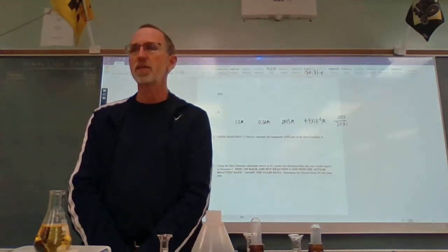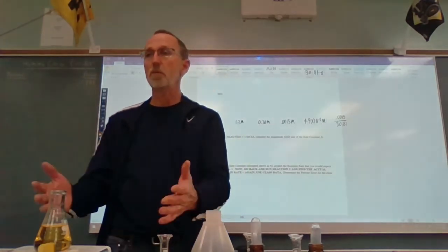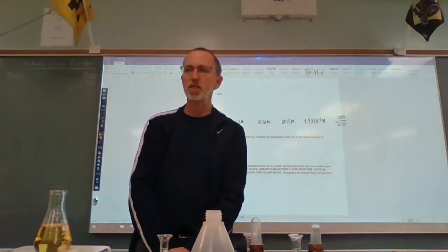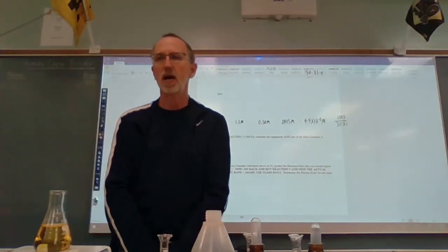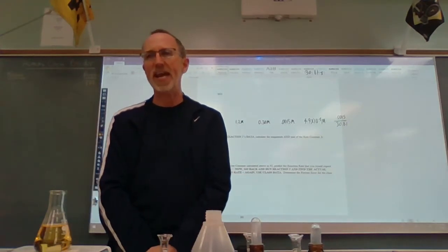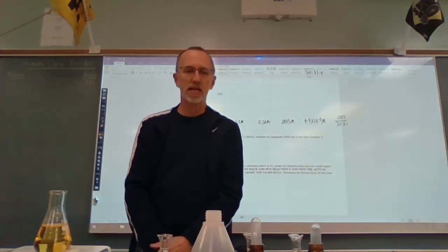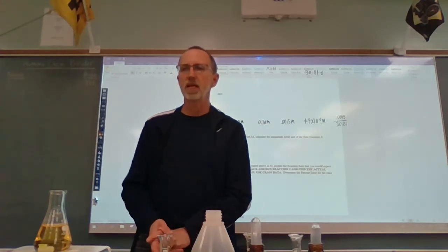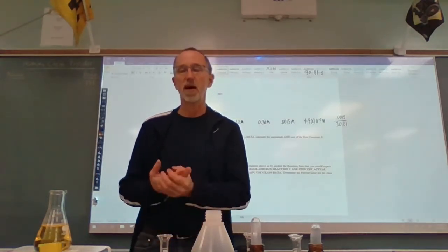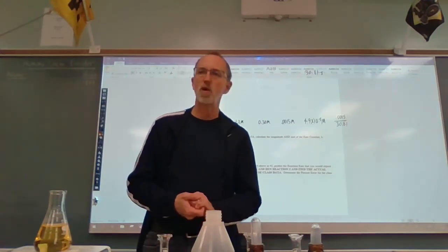From that, determining a rate constant value, and then being able to make a prediction by changing up the concentrations to whatever we want, making a prediction of a rate based on those new concentrations. And like I said, as I hope you'll see, the percent error came out very, very good. So that takes care of Lab 12.1.